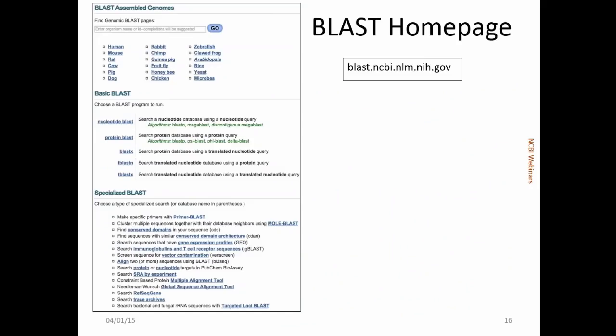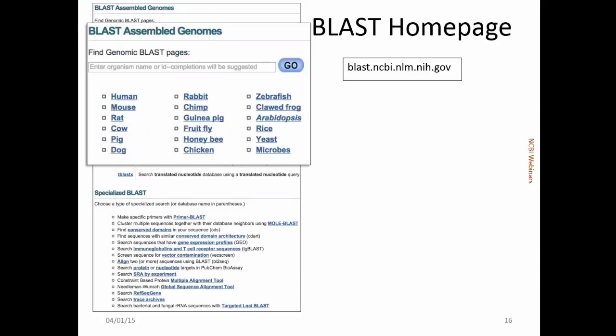It's organized into 3 sections, basically. It has its own sort of unique URL. Instead of being a www URL, it starts with blast: blast.ncbi.nlm.nih.gov. The 3 sections, we'll talk about these in sort of a mixed way today, because really I want to point out to you that some parts of this are just separate interfaces to the same databases. In particular, we're talking about the assembled genomes and things like that. So we have a way of getting at the assembled genomes with a fairly new autocomplete search box up there that's really a good way to find data.